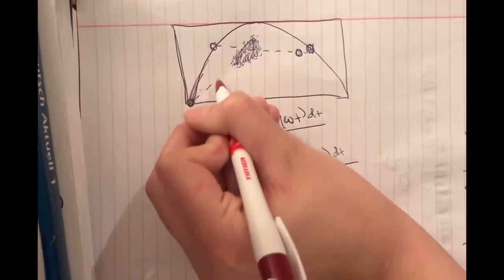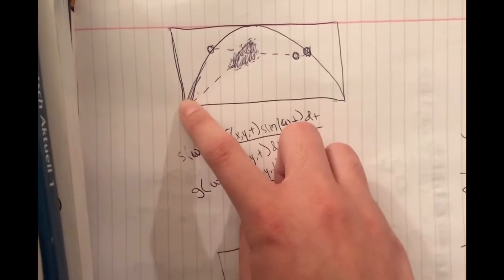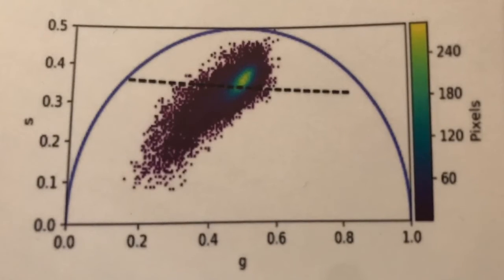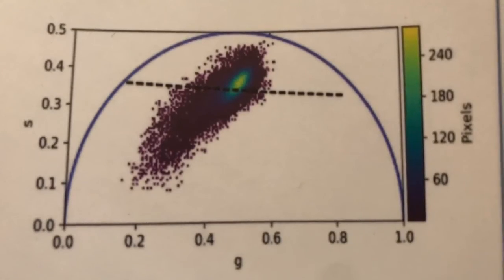Another component of the phasor plot is the tail leading towards the origin. We initially thought this was unmodulated light, however upon further inspection it's likely collagen fluorescence. We have switched to second harmonic generation imaging and added a new detector for collagen, and we will take collagen data into account in our next experiment.